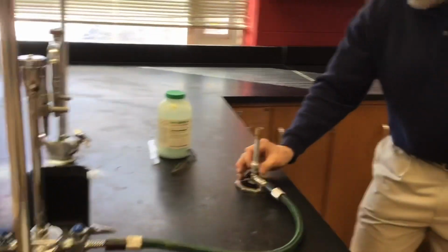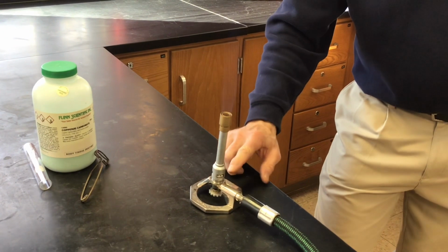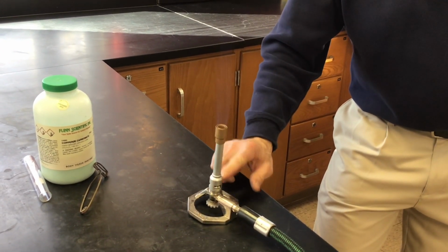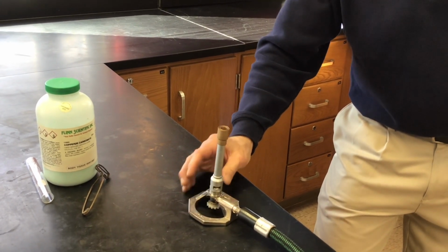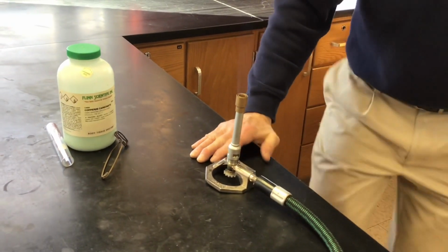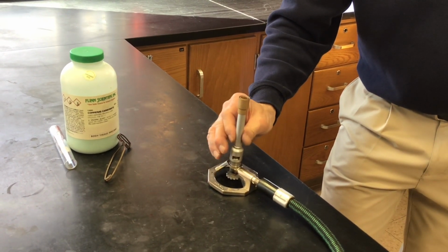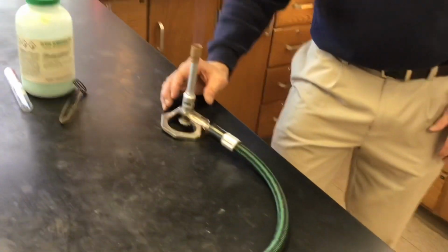Again, we'll adjust it to get the hottest flame, which basically means raising the barrel and letting more air come in at the bottom. Some of our burners are a little on the wimpy side, like this one. I don't know if we're ever going to get that nice clean inner flame.